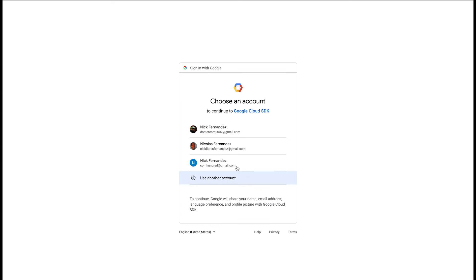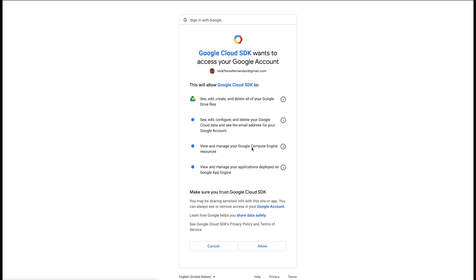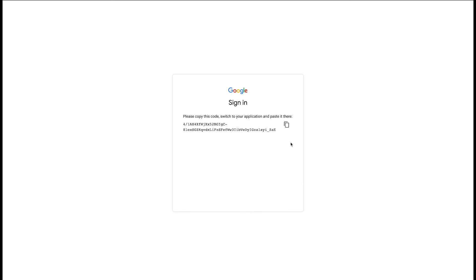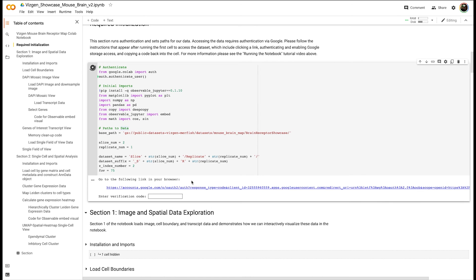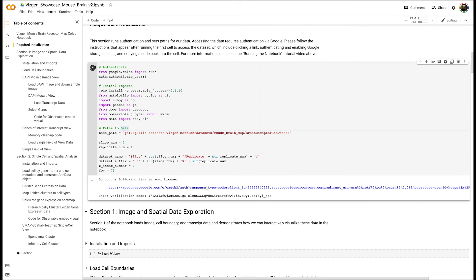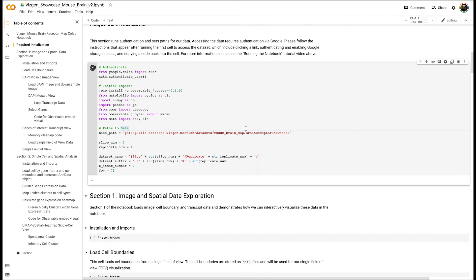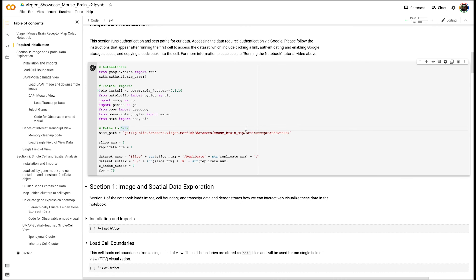It will authorize Google to have access to its cloud storage. So you copy this value over and paste the verification code in. After you've finished with that required authentication step, then you have access to our data, and you can run all the cells in the notebook.